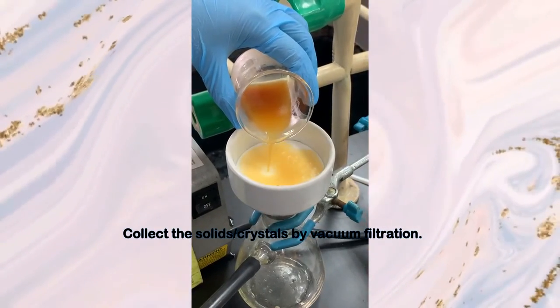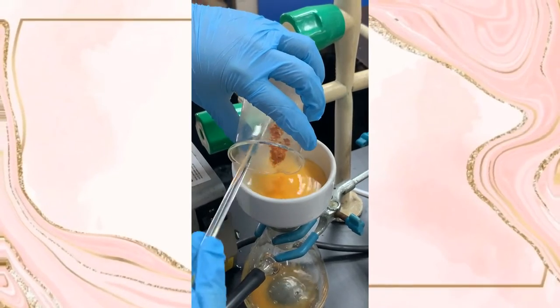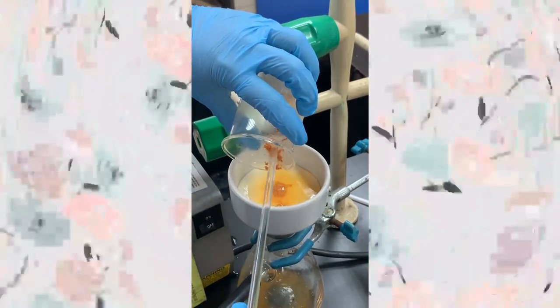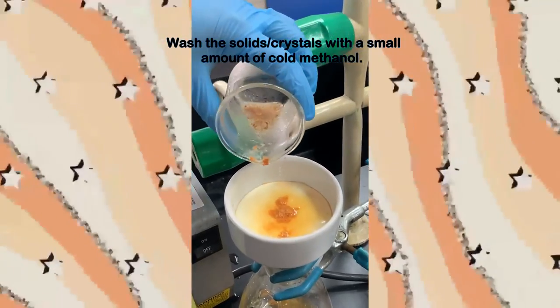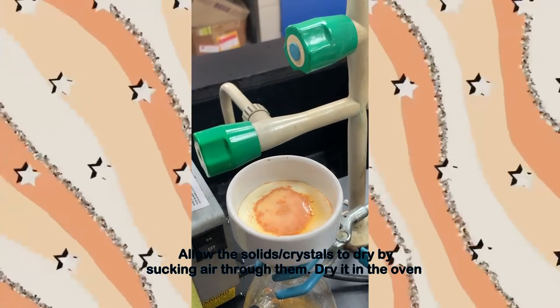Collect the solids or crystals by vacuum filtration. Wash the solids or crystals with a small amount of cold methanol. Allow the solids or crystals to dry by sucking air through them. Dry them in the oven.